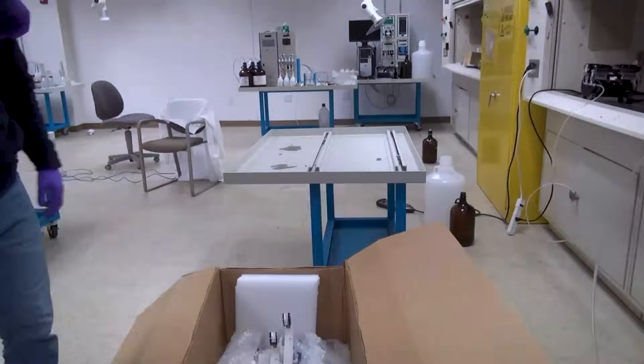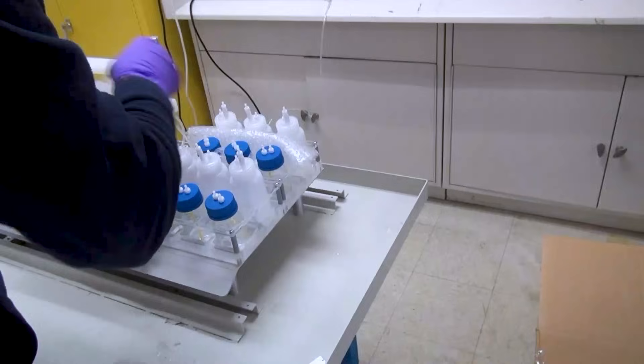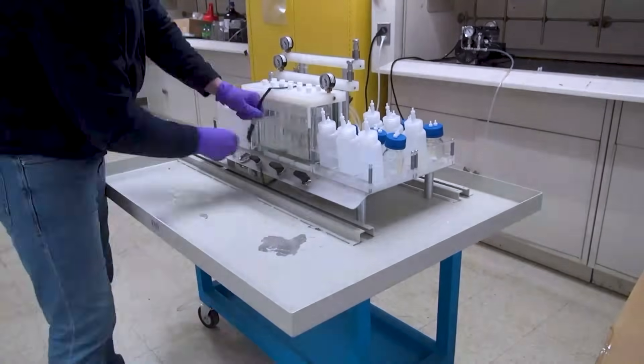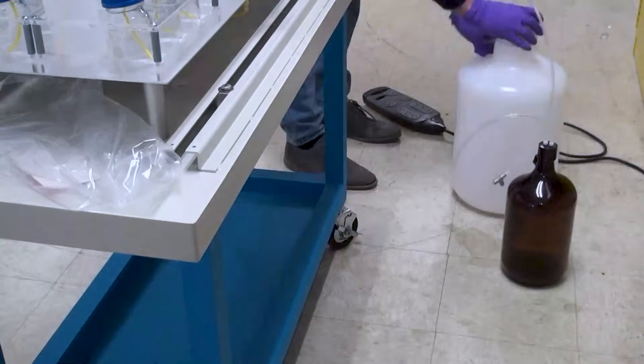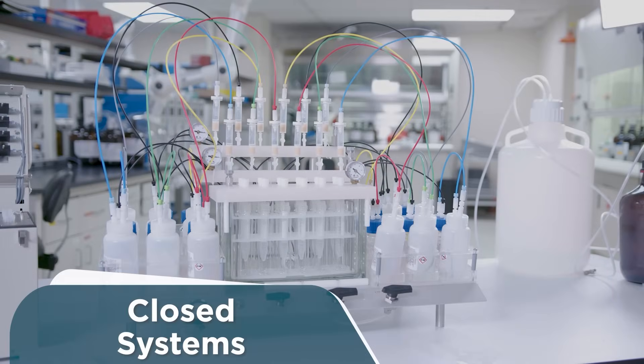The EZPFC is self-installable, easy to operate with no computer or electronics to fail or maintain, low to no capital expense.